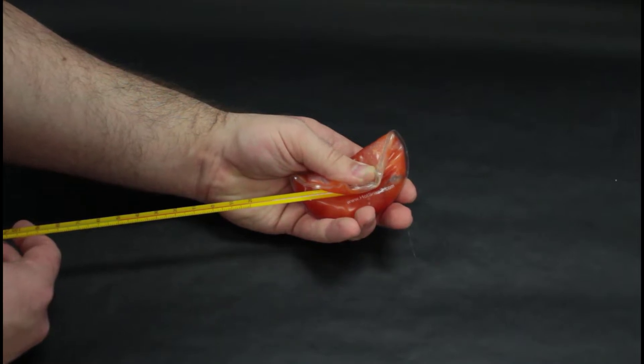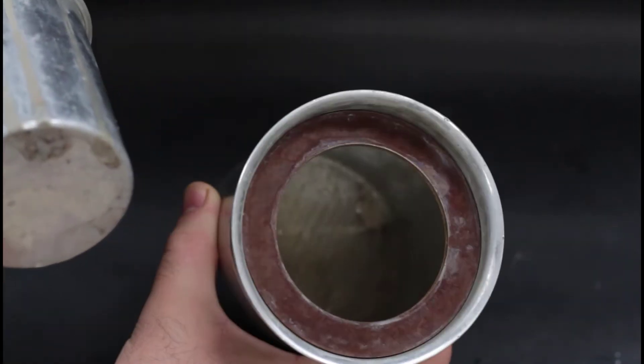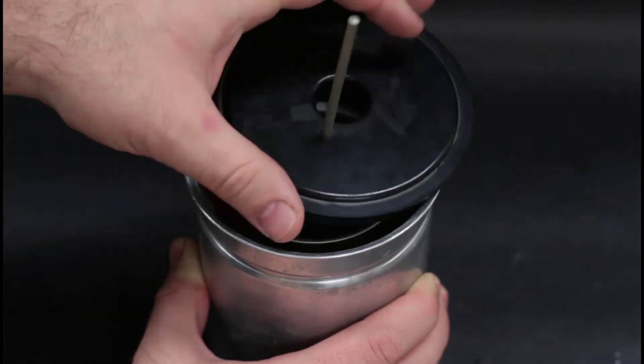A calorimeter is just an insulated container. In this lab, we'll be using some metal calorimeters, they're kind of nice, but you can actually construct one from two styrofoam cups and it works really well.